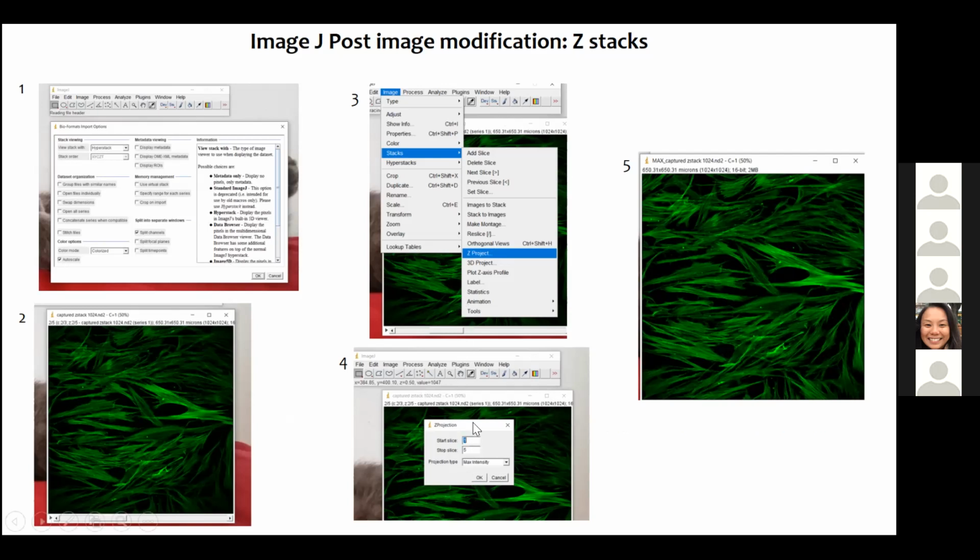And when you're doing the Z projection, I want to show this option to you guys. If you have taken 5 slices, that means that the image that I took was a depth of 5 slices. Each one of them, I think, was at 0.5 micron. You can either make it from 2 to 5 or 1 to 4 or 1 to 3. You can choose how many slices you want to report. However, if you're doing it with a wild type versus a treated, if you are changing the number of slices for one, you have to change it for the other one as well.